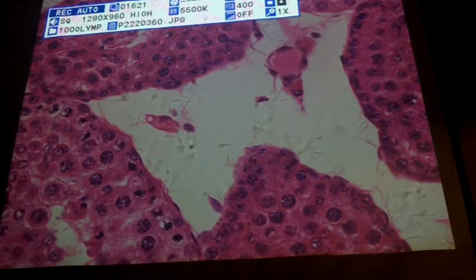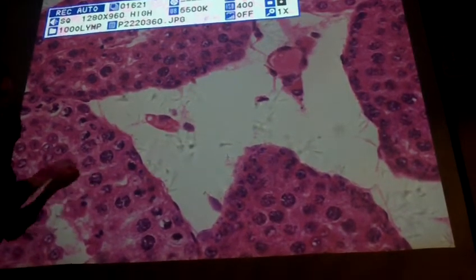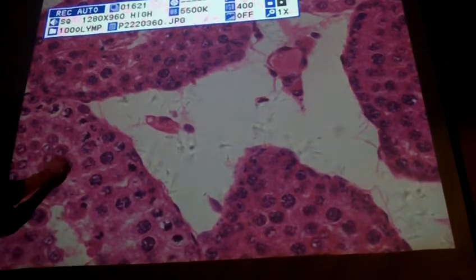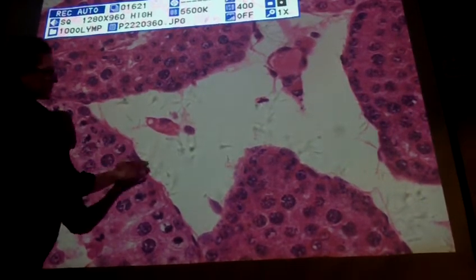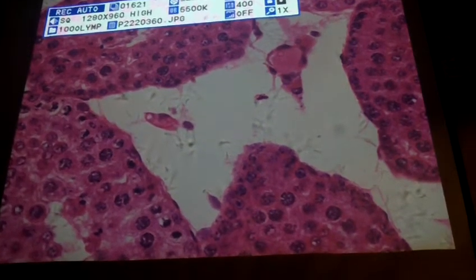But again, what I look for is this really thick layer, and you can see these cells very distinctly, and you can see the chromosomes in each of these cells. You can see it real clear. And again, the edge of the cells looks much cleaner than the epididymis does.